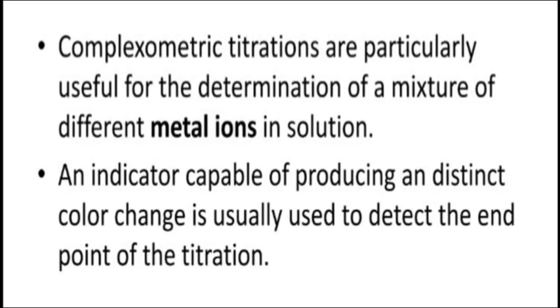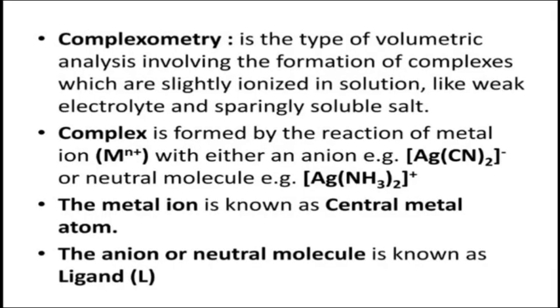Next, complexometric titrations are particularly useful for the determination of a mixture of different metal ions in a solution. An indicator capable of producing a distinct color change is usually used to detect the end point in titration.